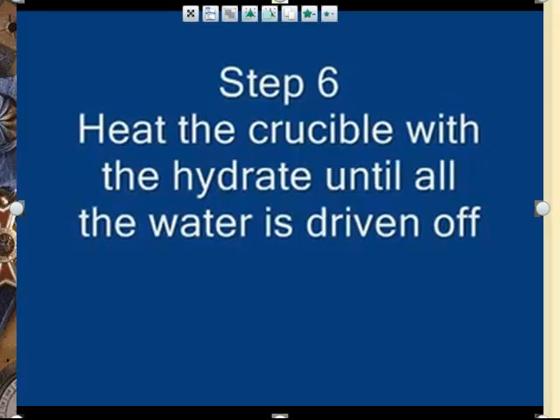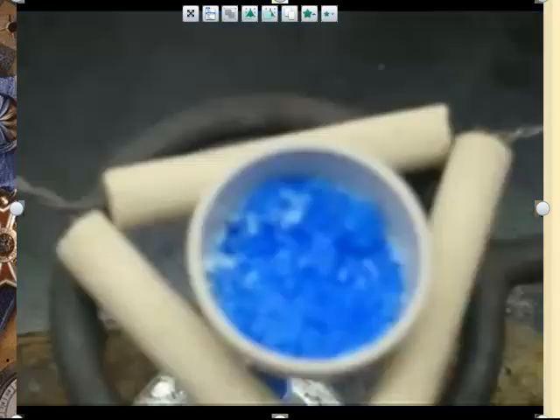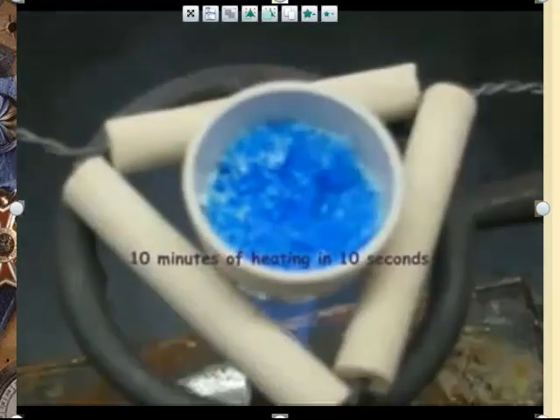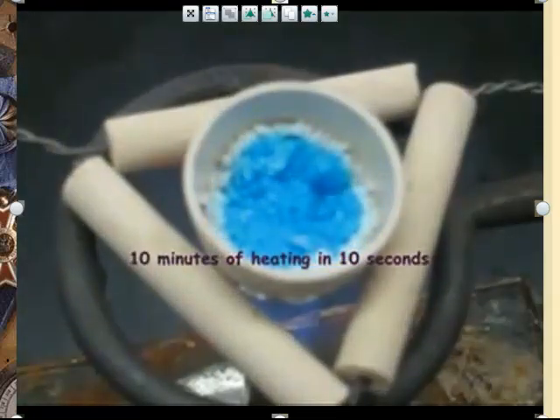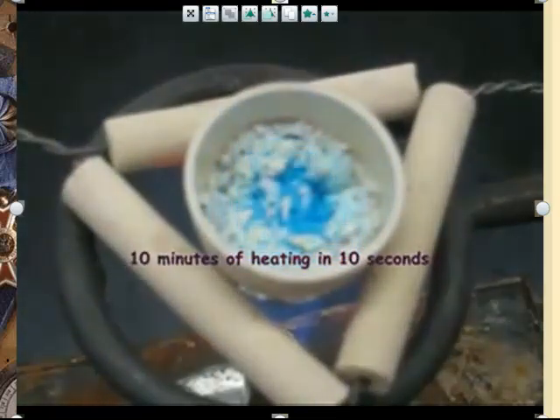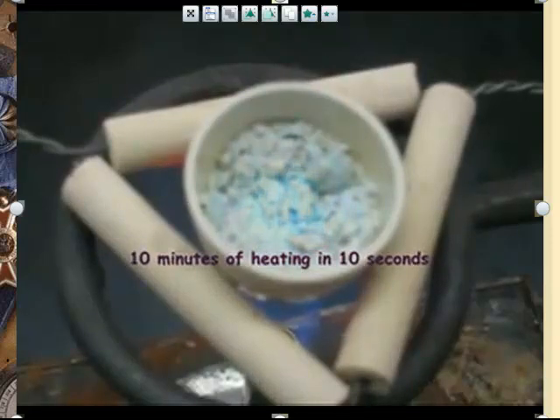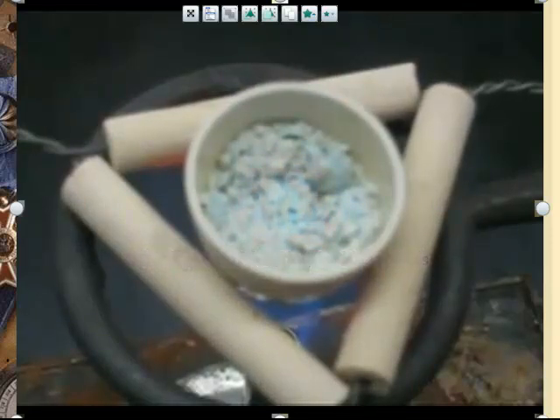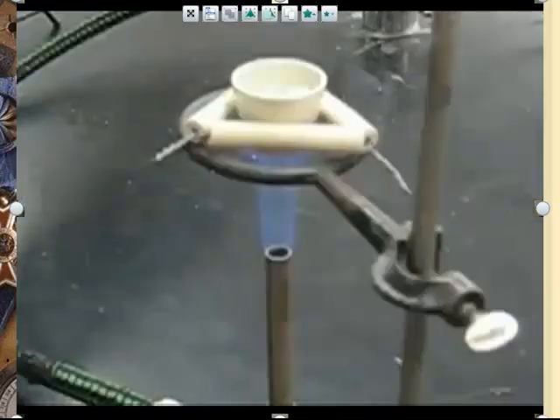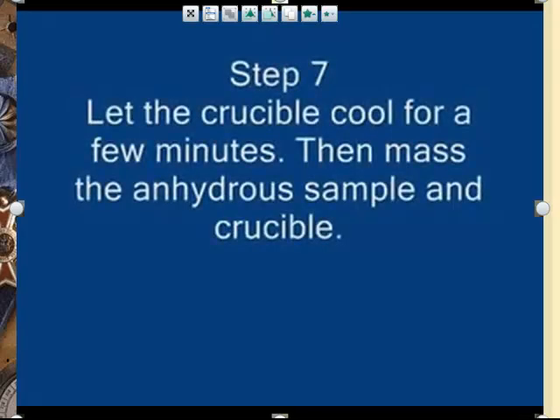So now what we're going to do is we're going to heat this sucker to get rid of the water. So we put it under the Bunsen burner, and you can see pretty neat camera work there, 10 minutes and 10 seconds. And you can see this particular hydrate is neat because it changes color. It goes from blue to white. So now we've driven off the water. We've broken that weak bond between the CUSO4 and the water, and we've got to let it cool again.